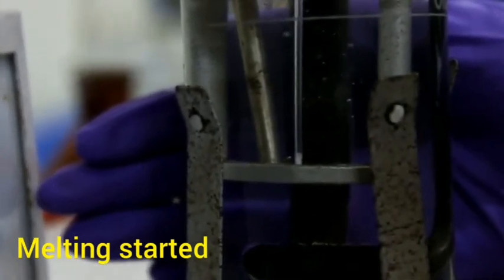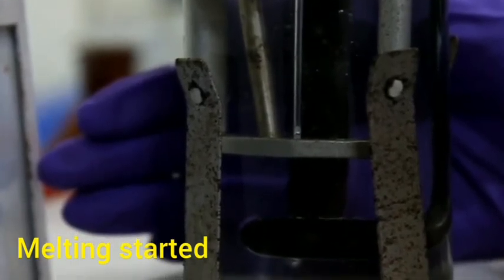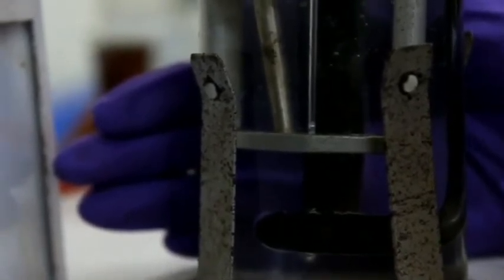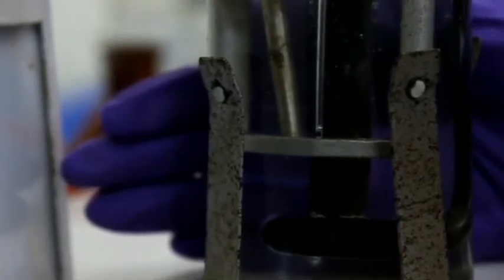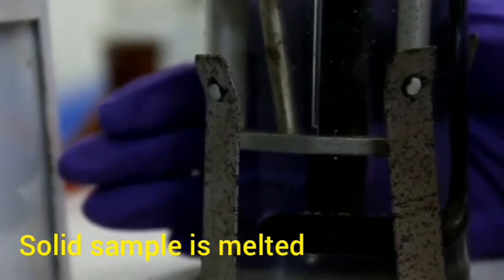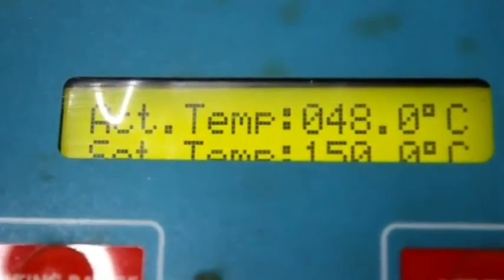We can see the sample started melting. We noted the temperature, that is 47 degrees Celsius. The sample is melted completely. So the melting point range is 47 degrees to 49 degrees centigrade.